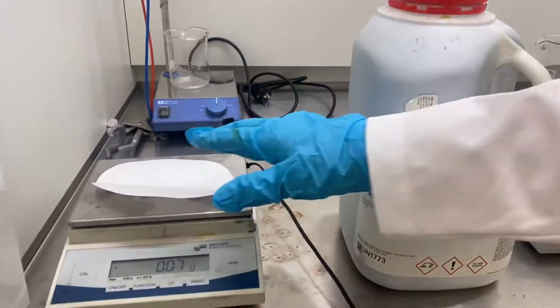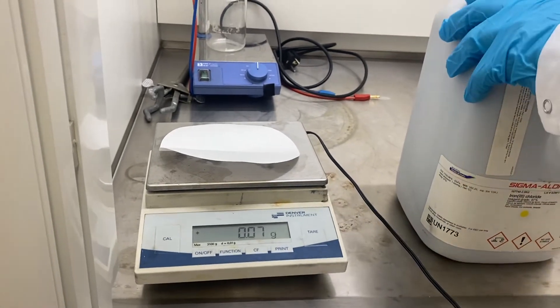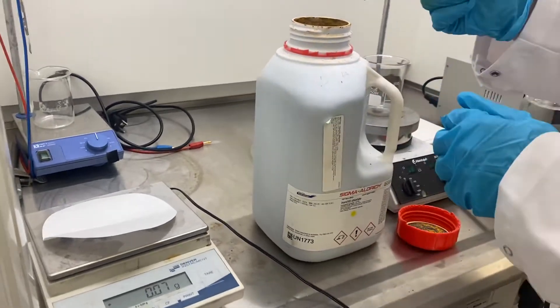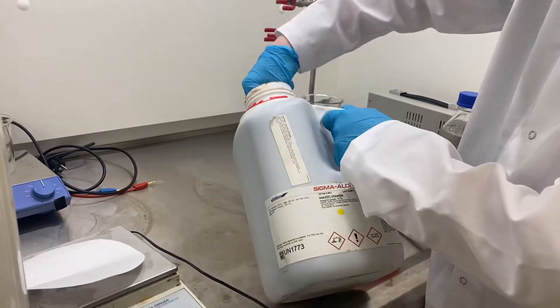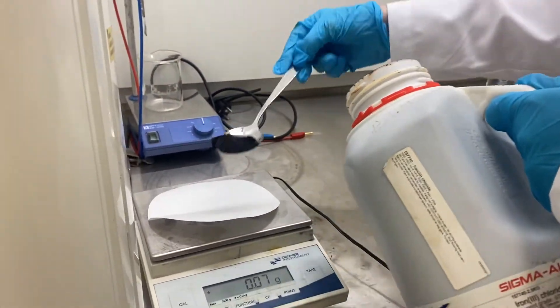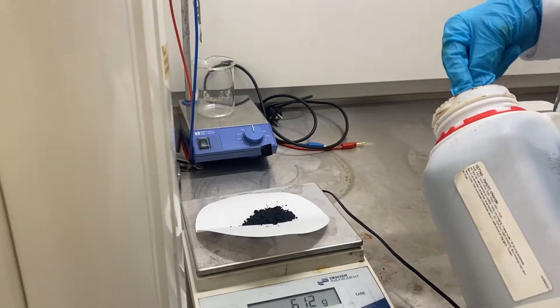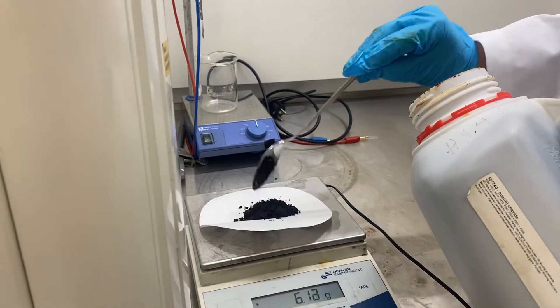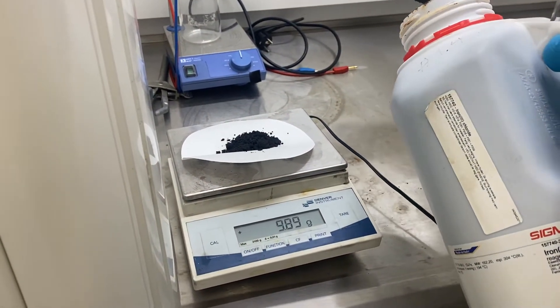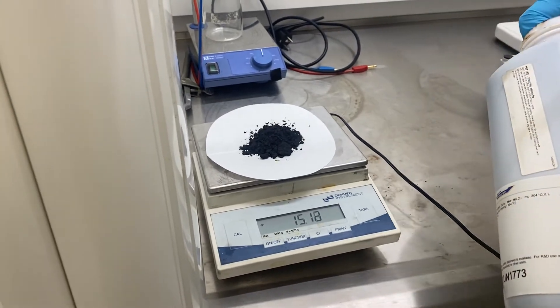I'm going to weigh some of this out on filter paper on the balance. Taking the top off the bottle and using a regular spoon to start getting some out. It's a dark brown powder — that's 6 grams, a bit more, okay that's 10 grams, a little bit more. It needs to be quite strong to do this, so I'll take it up to about 20 grams.